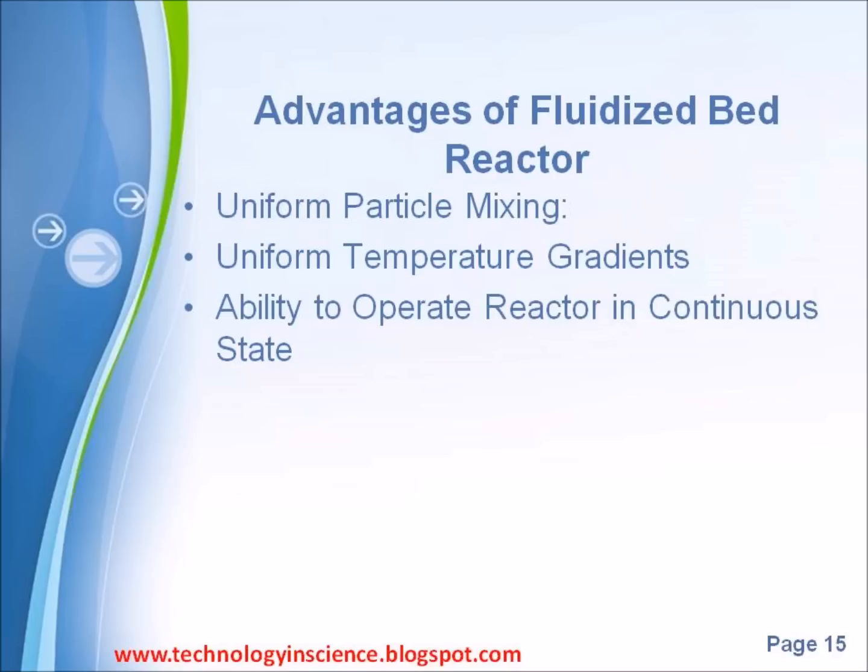Ability to operate the reactor in a continuous state. The fluidized bed nature of these reactors allows for the ability to continuously withdraw product and introduce new reactants into the reaction vessel. Operating at a continuous process state allows manufacturers to produce their various products more efficiently due to the removal of startup conditions in batch processes.